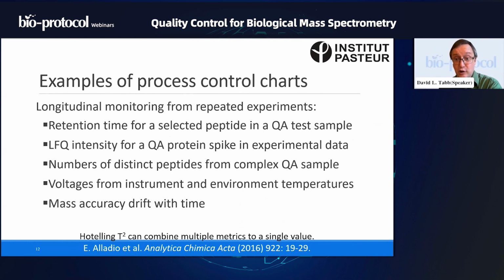All right. So what am I going to use a process control chart for? One of the best uses for it, David, I saw you moving, so if you have a question, by all means. Okay, great. So for examples of process control charts, one of the things that we're most typically going to do is longitudinal monitoring, which is to say, we want to create an historic record for how this machine performs across a long spate of time.